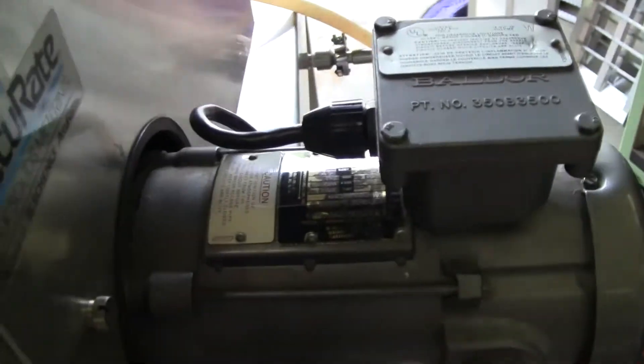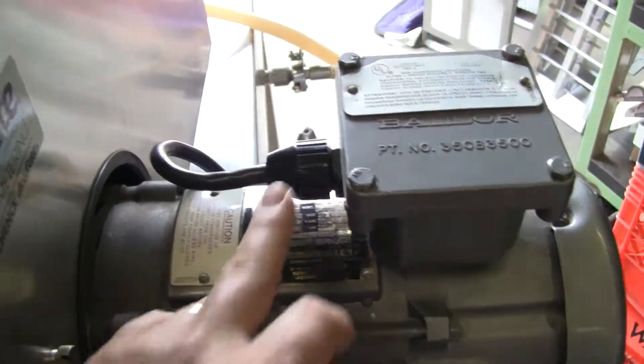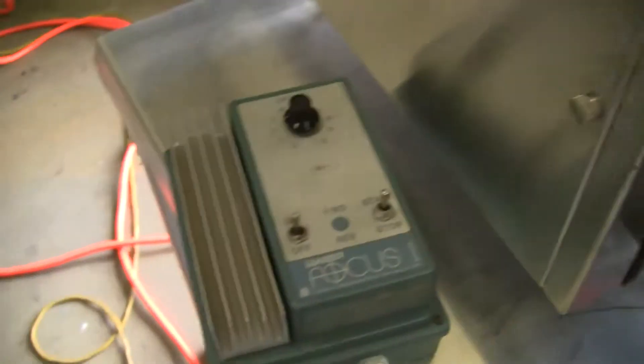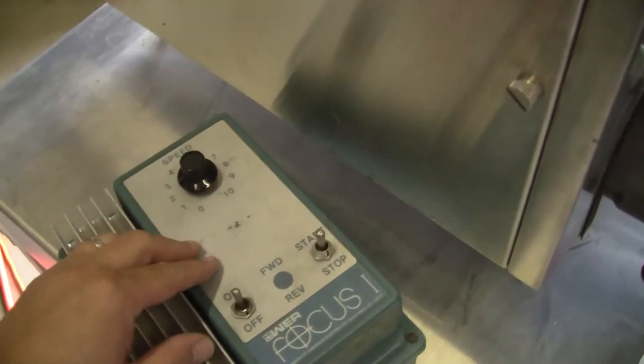What we wanted to point out very carefully is that the explosion-proof motor here, we've hooked it up to a standard motor or motor control, speed controller.